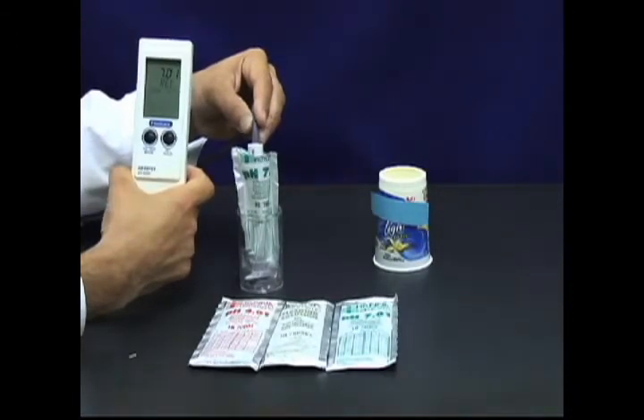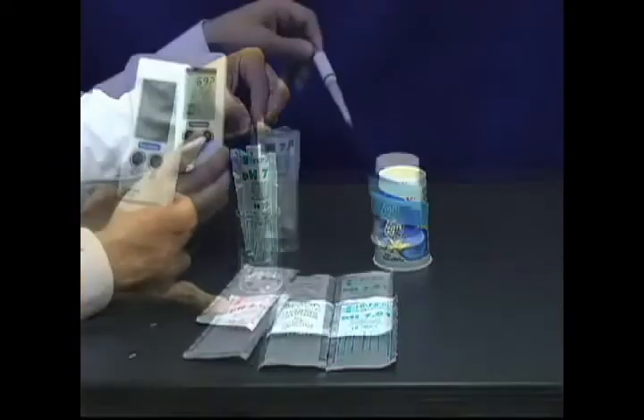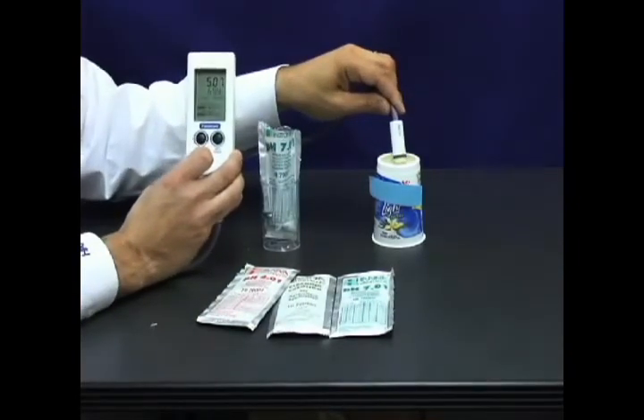If you want two-point calibration for enhanced accuracy, simply place in a four-buffer solution next. Now that your meter is calibrated, just dip the electrode in the sample and you're done. The meter will give you a pH and temperature reading instantly.